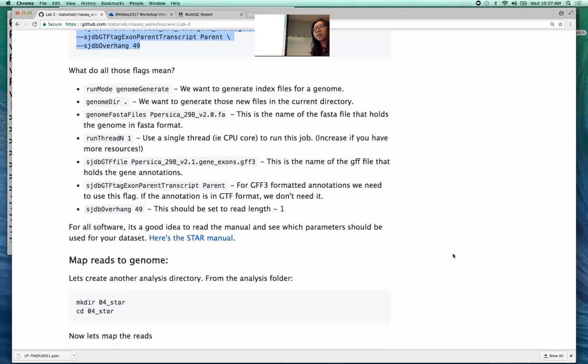So you can shrink the word size and say, I only need exact matches of 10 bases or 20 bases to try to map the read. At that point, what you'll see is a very significant increase in computing time, because your index is going to grow almost exponentially with the increase in the number of words that have to be stored.